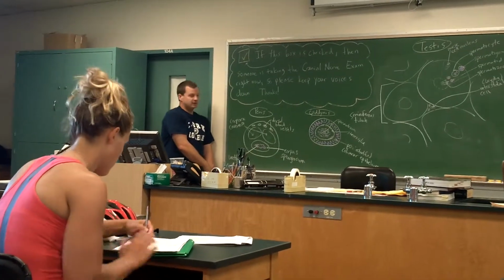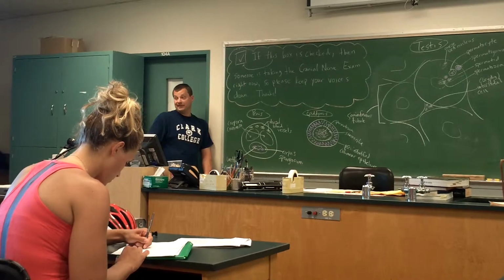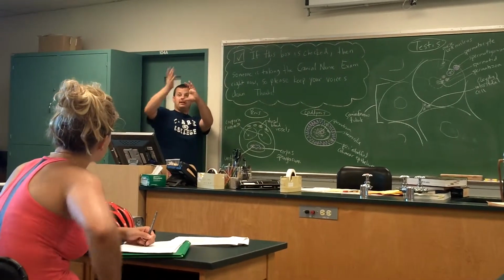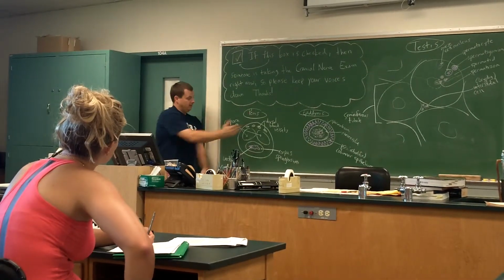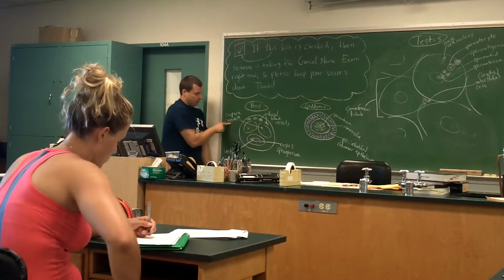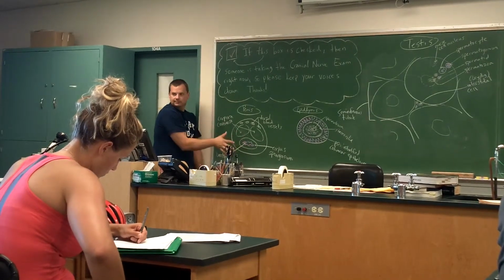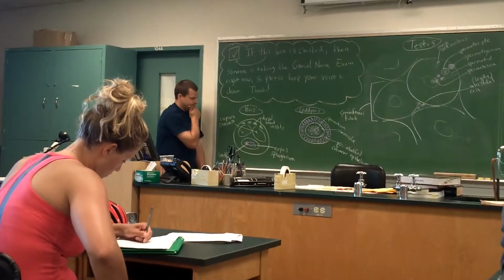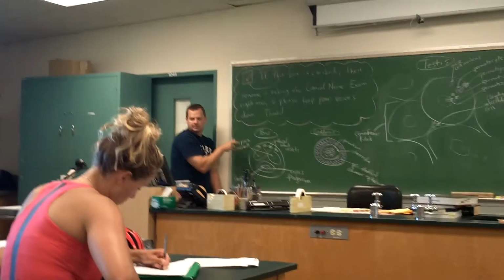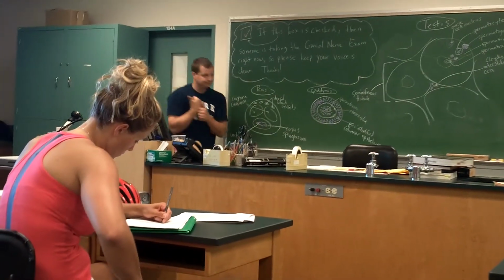And the other difference is on the adult human penis slides we have, it's half of the penis. So instead of having the whole thing, they sliced it, whoosh, right there. So you end up with basically one of the two corpora cavernosa and half of a urethra, you know what I mean? So I'll show you that in a minute. So keep those things in mind as you look at the penis slides. So let's take a look.